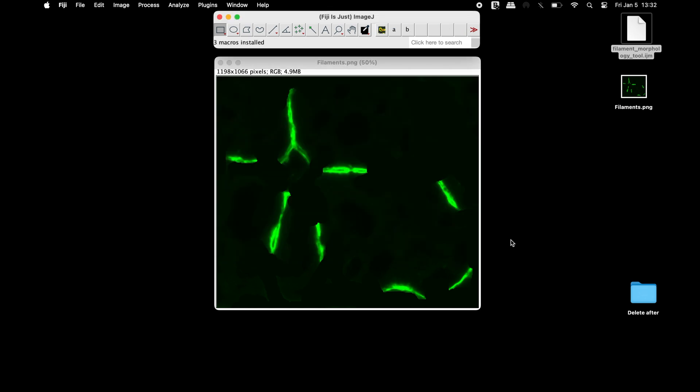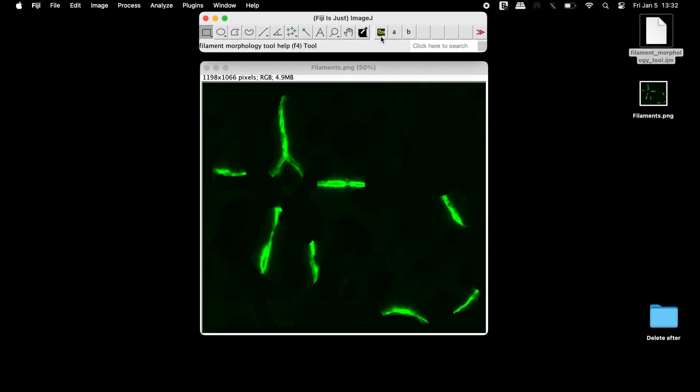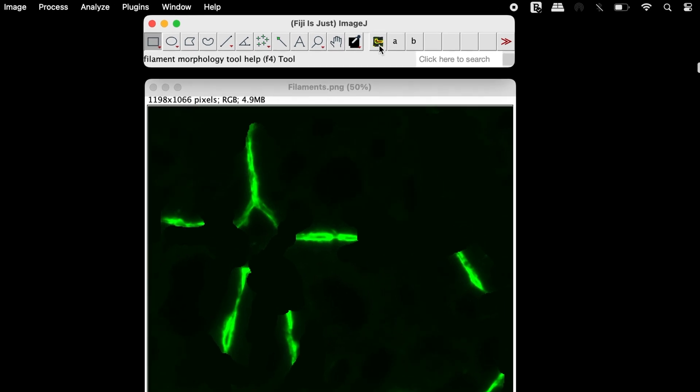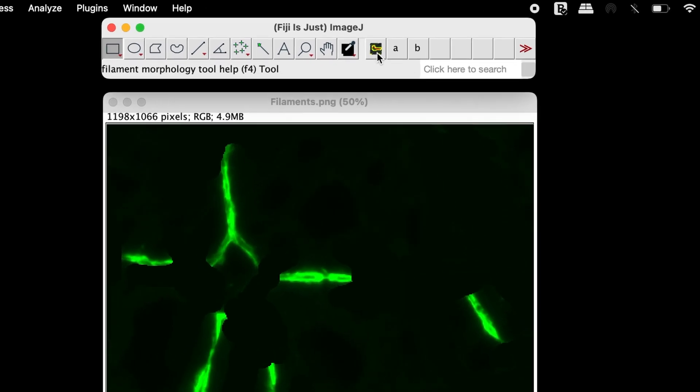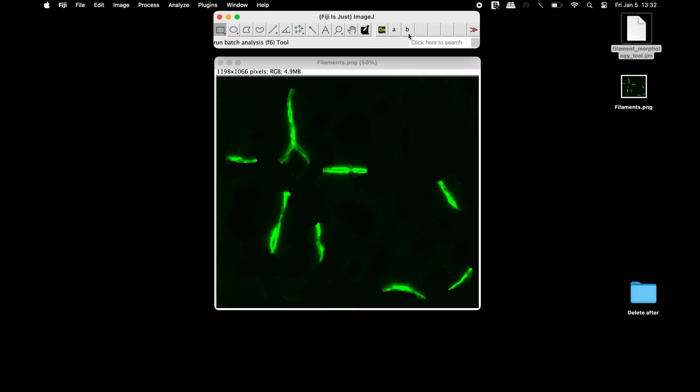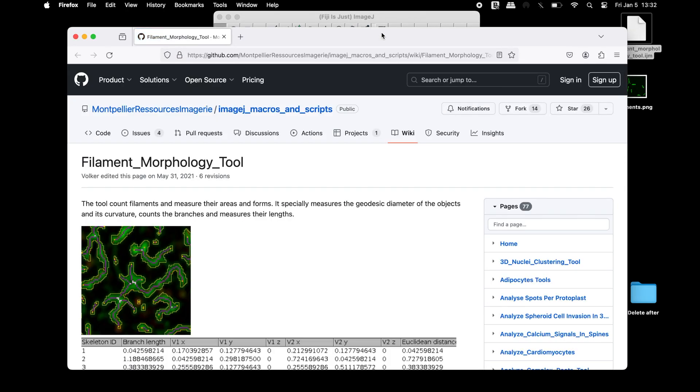Upon successful installation of the macro, three icons can be seen in the Fiji toolbar. The first icon leads to the FilamentMorphologyTool webpage.